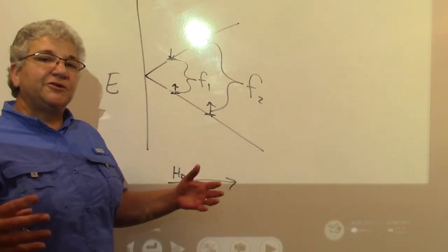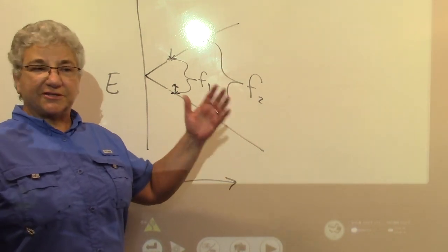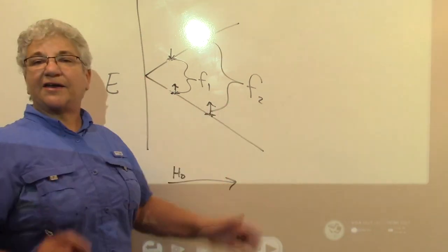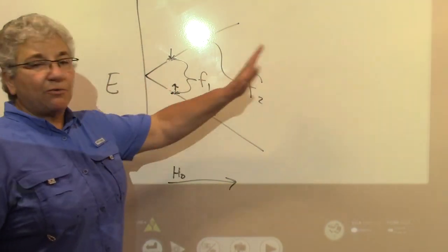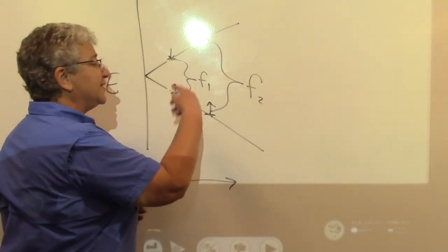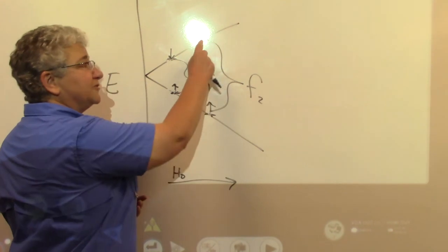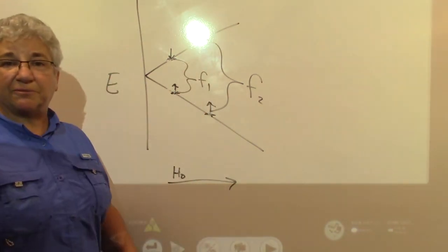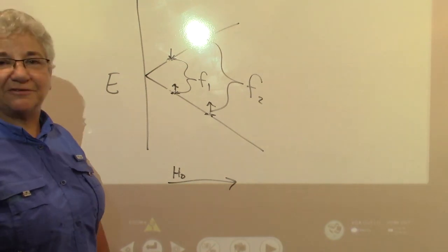And so what we do in the NMR is we take a really wide range of radio frequencies and fire that at our sample. Ideally our sample can pick whatever frequencies it needs in order for these nuclei to spin flip, from with the field to against the field. We just call that a spin flip. It's not exactly what's happening, but we're not going to worry about that till advanced organic.